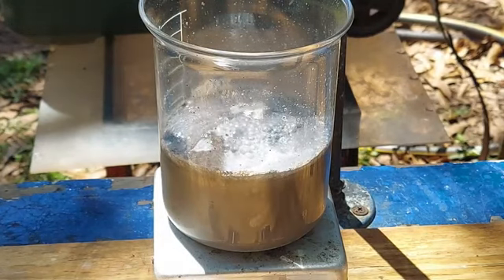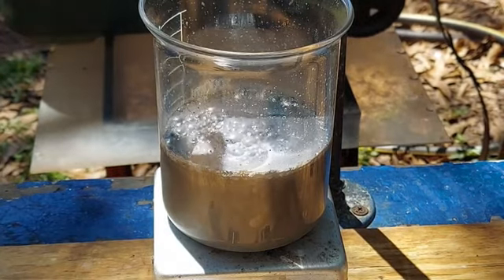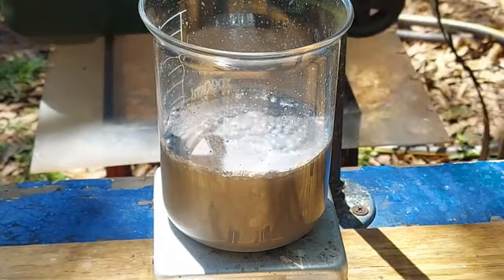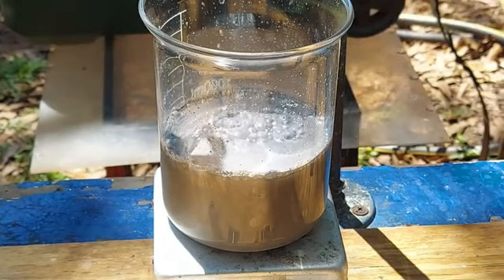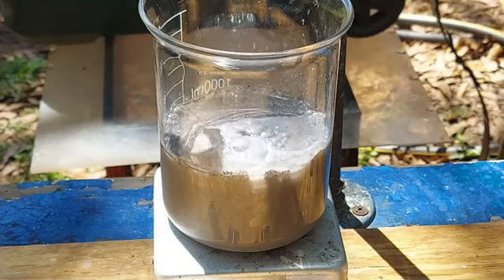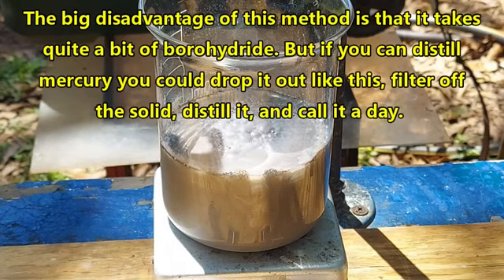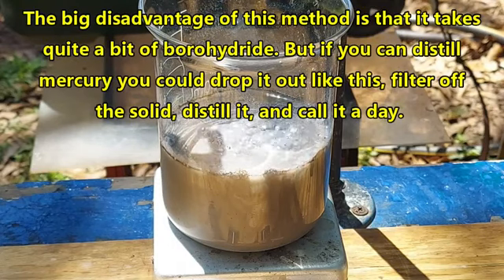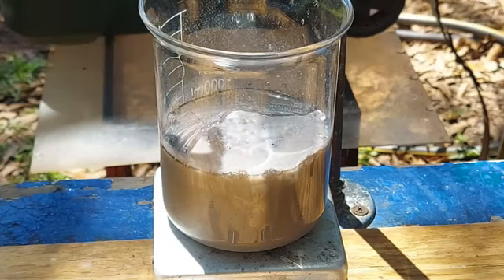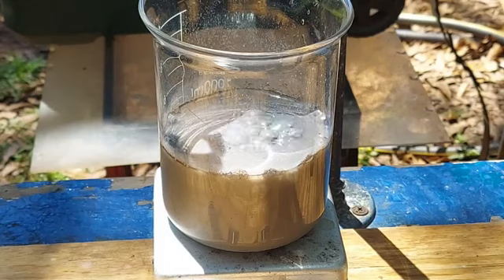See what I mean about aerosols? Little droplets of it on the side of the beaker already. Hanging out in that cloud. Let it stir for a little bit with our mercury sludge. Man, this is so bad. See, this is why my bench is made of wood, so I can burn it if I have to after I do things like this.